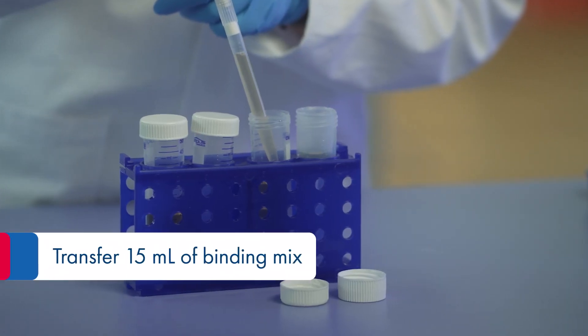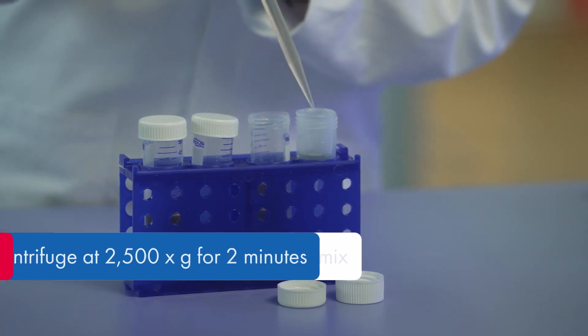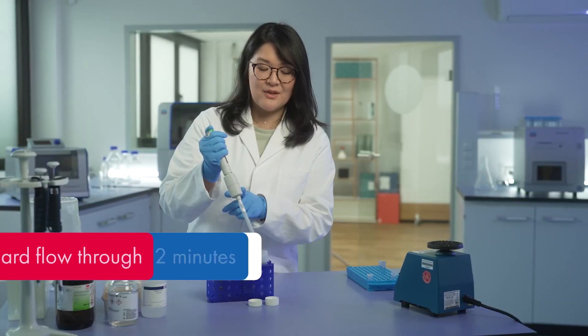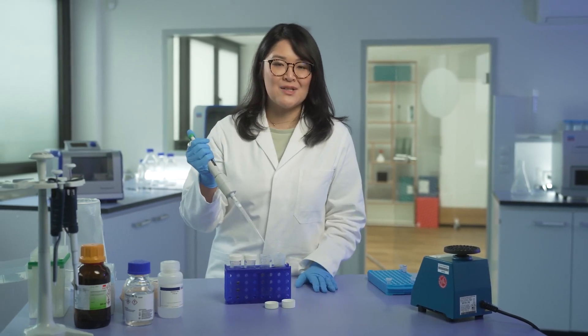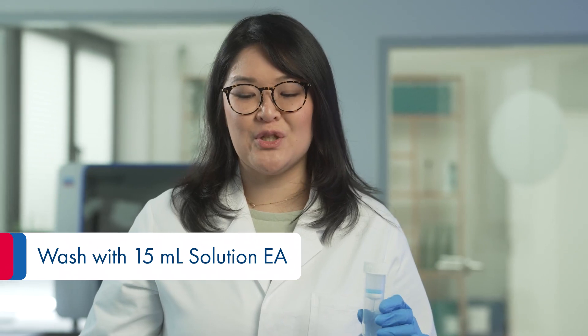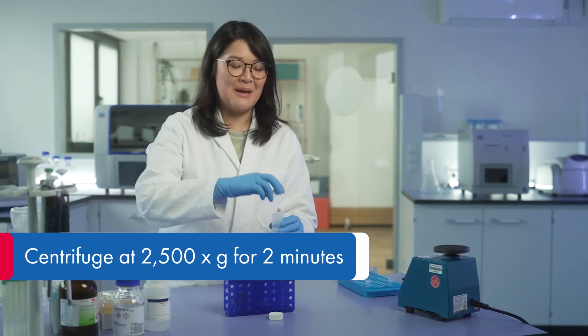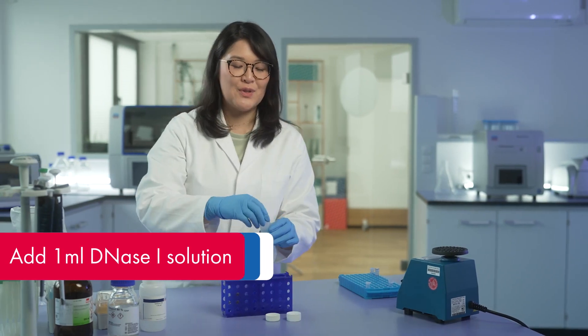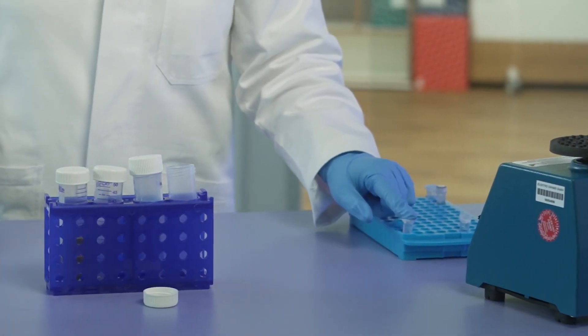Transfer 15 ml of the binding solution onto the MB-spin column, centrifuge the tube, discard the flow through, and repeat for the remaining binding solution. After centrifugation, wash the membrane with solution EA and centrifuge another time. Place the MB-maxi-spin column onto a new 50 ml collection tube and add DNAs 1 solution.